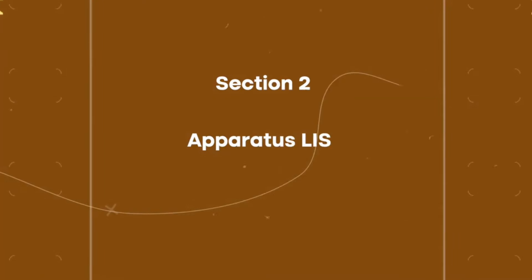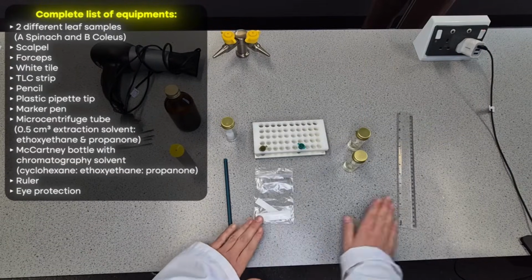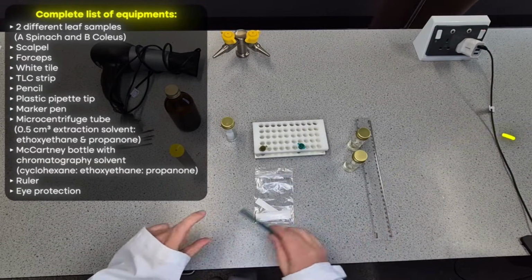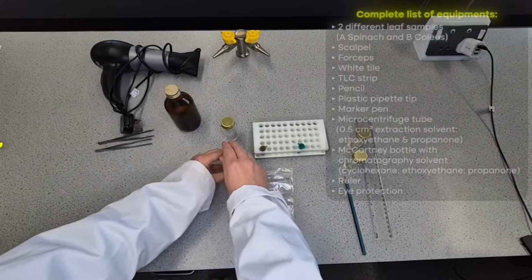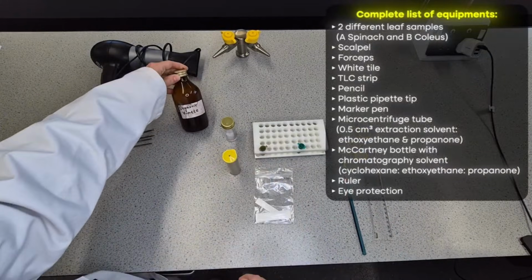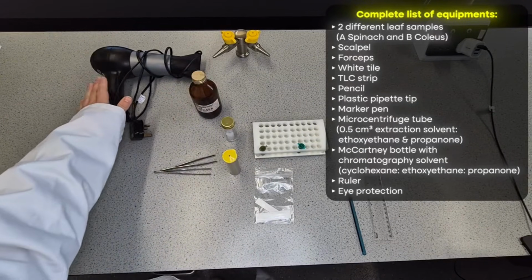So the equipment then that we have for this experiment is I've got my TLC paper, I've got a ruler with millimeter measurements and a pencil. I've got capillary tubes just here. I have my organic waste bottle to dispose of the solvent safely at the end. Forceps, and a hairdryer to help dry the pigment if we need that.